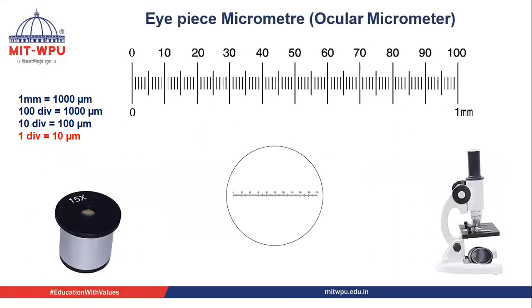Then we also need an eyepiece micrometer, also called an ocular micrometer. It is circular and fits into the eyepiece, which is placed on the microscope. If we enlarge it, it looks the same as the stage micrometer — 100 divisions, each equal to 10 micrometers. Depending on the lens being used, we need to calibrate the eyepiece micrometer.